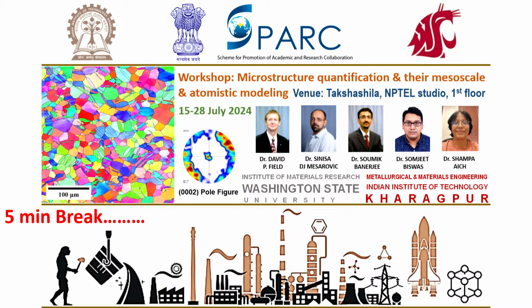So now let's take this one and do again a new chart. But this time I'm going to do a crystal direction chart, which is here. And then when I edit that, I'm going to add one. So now all I have is a pole, right?